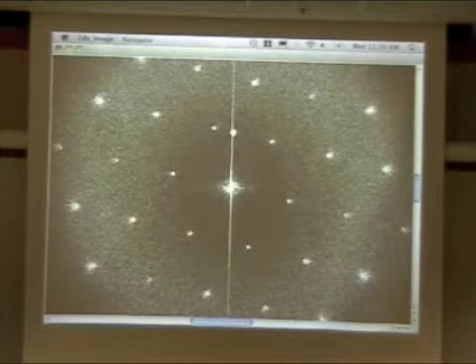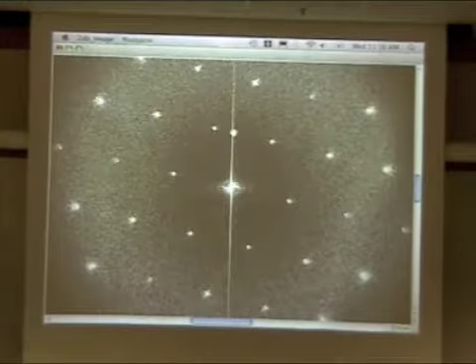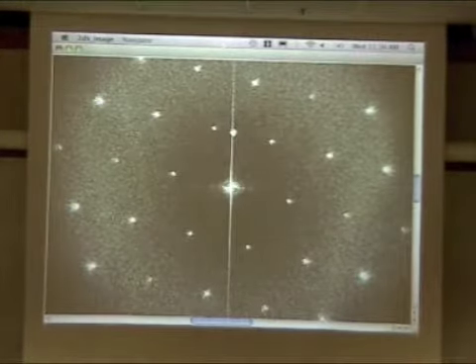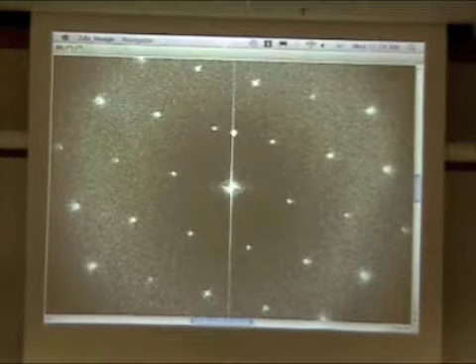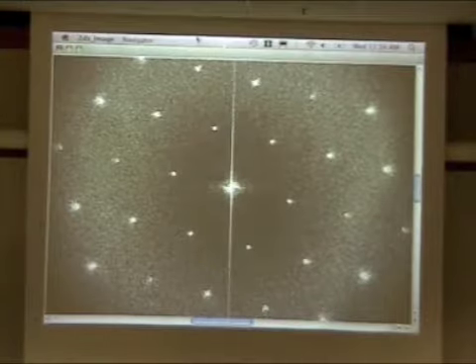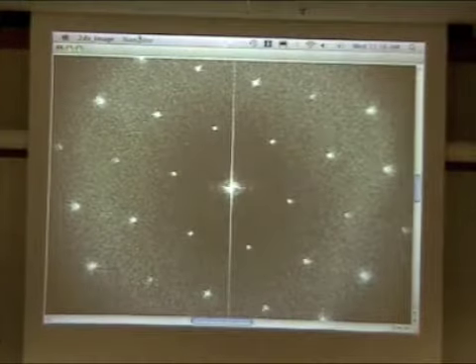It doesn't do anything besides this. So at the moment, it's just a really fast image viewer. If you've got a big 14K by 14K image and you want a quick thumbnail view of it, that's a gigantic thumbnail, then this is the place to go. I'm trying very hard not to screw this up, to use a technical term.